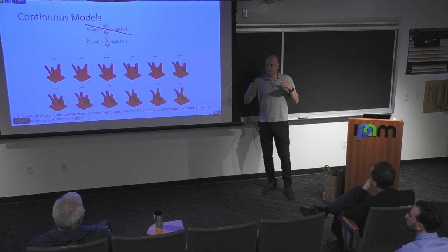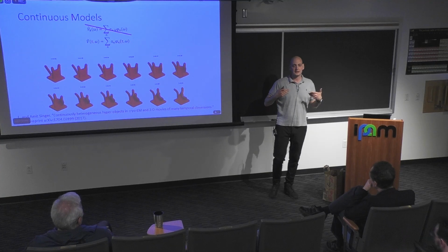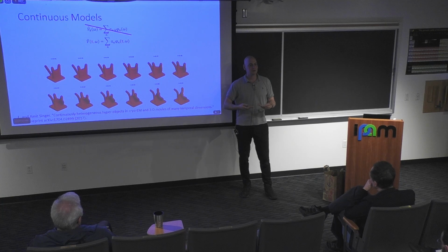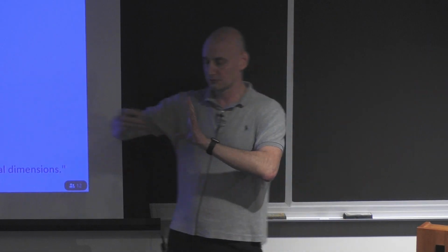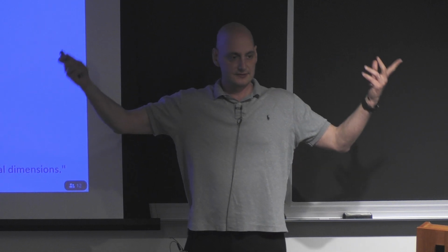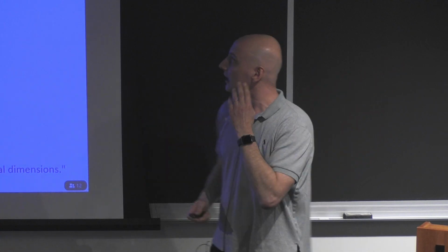And this visually pleasing smoothness thing, you can think about it as some kind of regularization, for example, that makes a difference between the smooth transitions between different volumes and these distinct independent conformations.